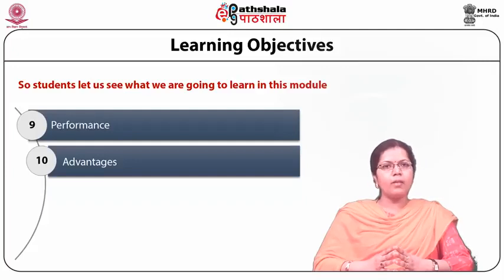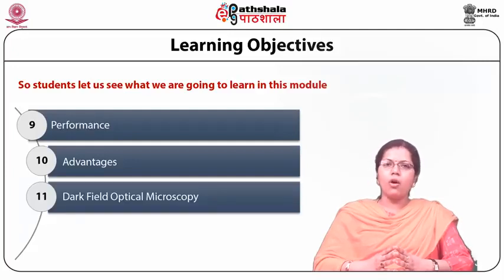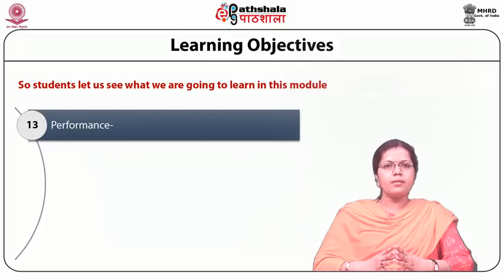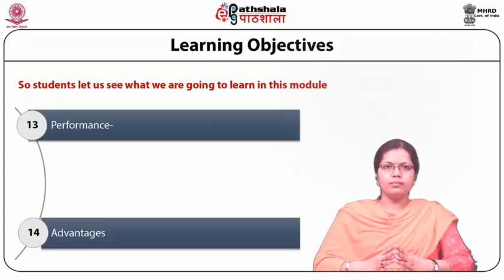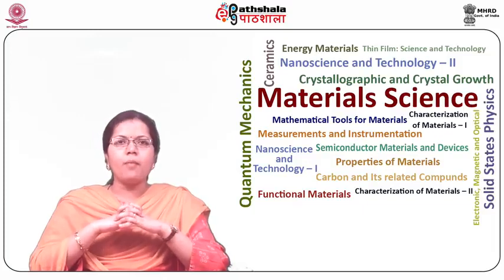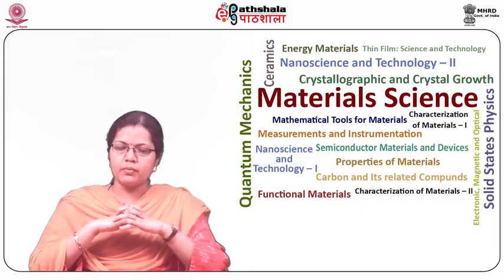Thirdly, we will study dark field optical microscopy, in which again we will cover the light path, its performance and advantages. First of all, let us study optical microscopy.